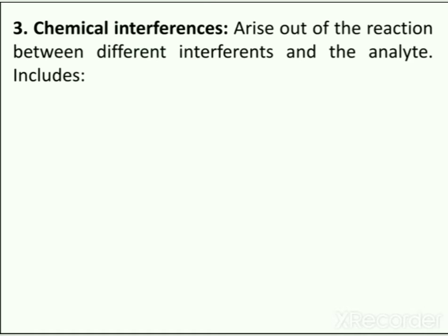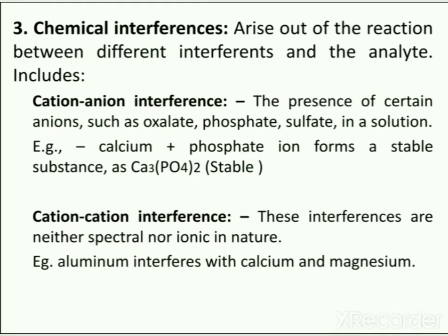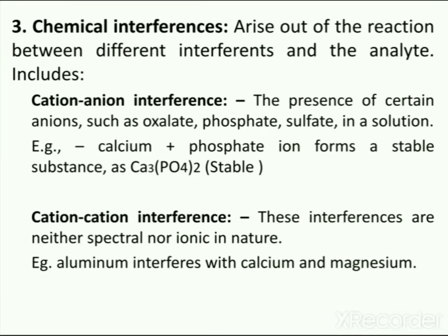Chemical interferences arise from reactions between different interferents and the analyte, and are of two types: cation-anion interference and cation-cation interference. In cation-anion interference, the presence of certain anions such as oxalate, phosphate, or sulfate in a solution may affect the intensity of radiation emitted by an element. For example, calcium plus phosphate ion forms a stable substance Ca₃(PO₄)₂ which does not decompose easily, resulting in production of fewer atoms. In cation-cation interference, mutual interference of cations has been observed, resulting in reduced signal intensity of the element being determined; these interferences are neither spectral nor ionic in nature. For example, aluminum interferes with calcium and magnesium.